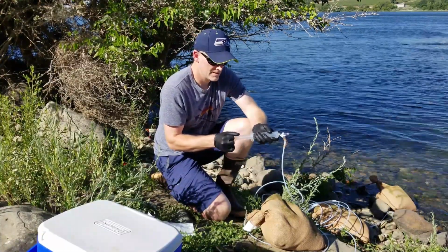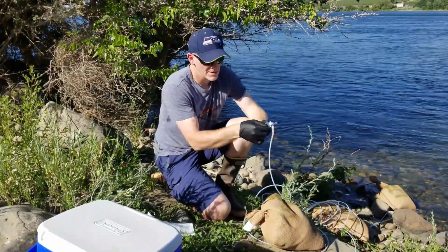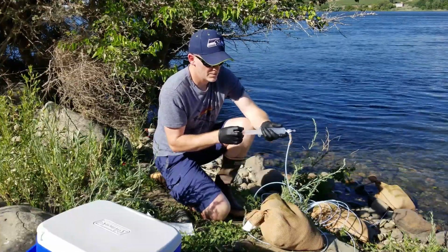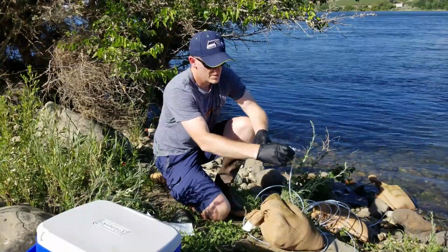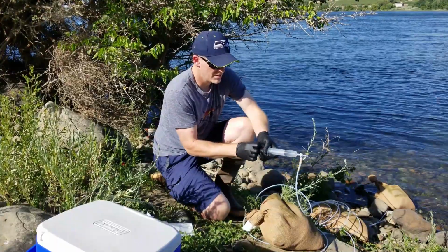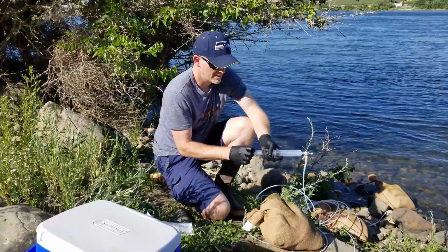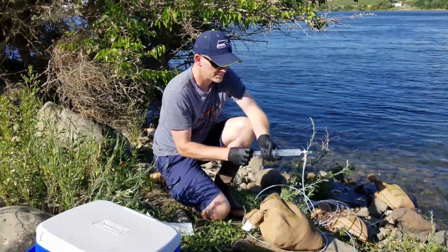So you're going to start pulling. First you're just going to get air. You've got to keep moving the three-way valve. So you're pulling from the tube, and then you're expelling that air. Switch it back and keep going. Now we're starting to get some water. Let the tube fill up. Let the syringe fill up.